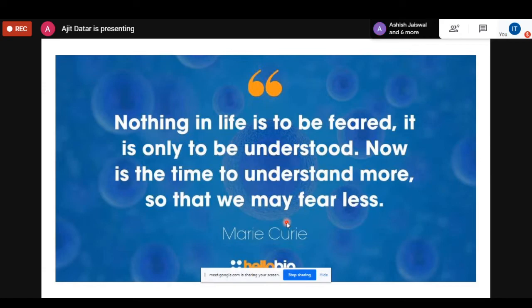So the polarity of the sample is very important. If it's polar in nature, and if it is soluble in water or methanol, or even to some extent acetonitrile, you can get it ionized in LCMS, and you will be able to see the peak. I don't consider a peak area, but the peak needs to be seen. If you get the peak, you definitely know the mass of that compound, and by doing MSMS or fragmentation of that, you will know roughly what that compound could be. So you can get some good information provided you do proper work.